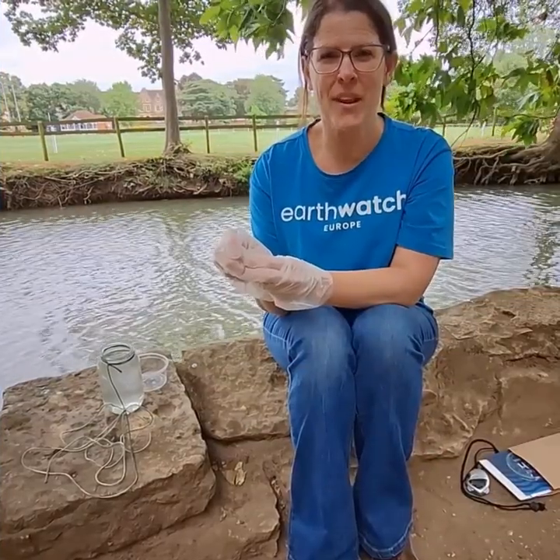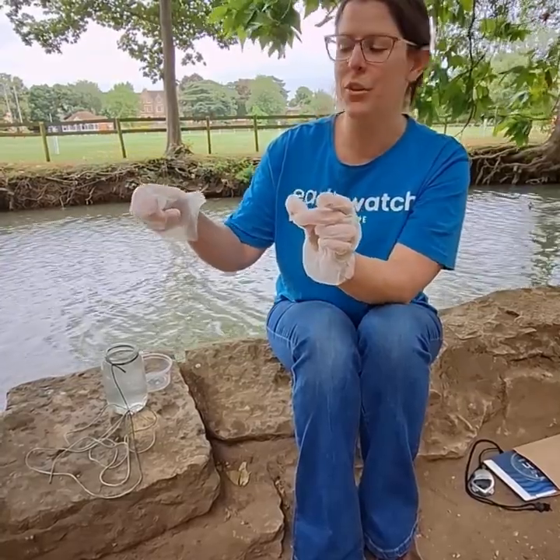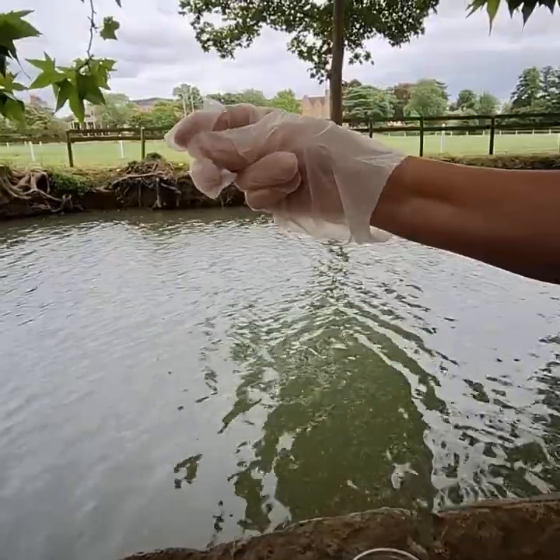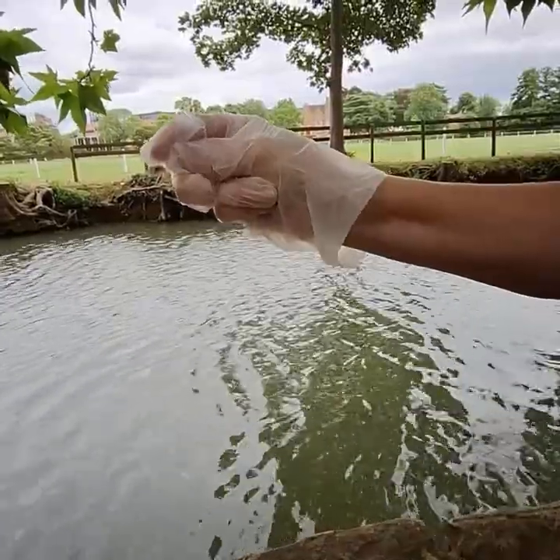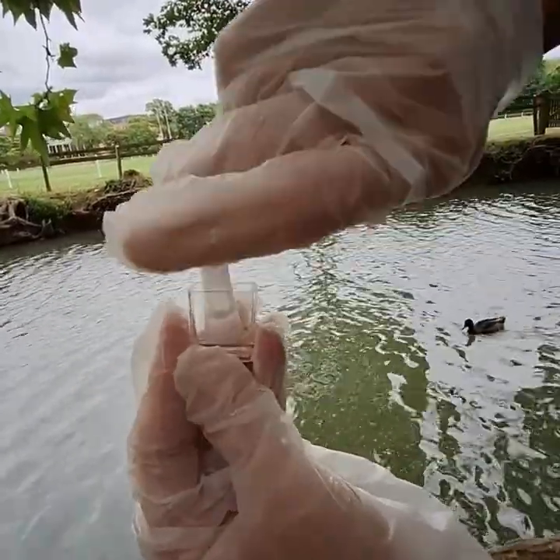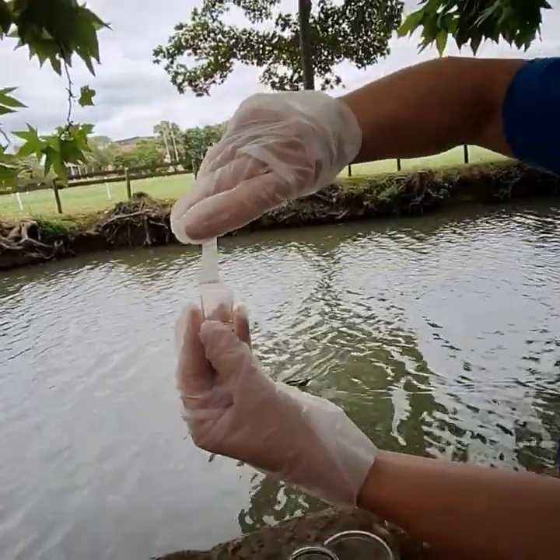If you have help, ask someone to hold the cup for you. If you don't, I find the easiest way is to put two fingers and a thumb on the tube, squeeze and bend to make sure all of the air is out of the tube before turning it upside down, putting it into the bottom of the cup, and releasing. You can hear a noise once all the water has been drawn into the tube.